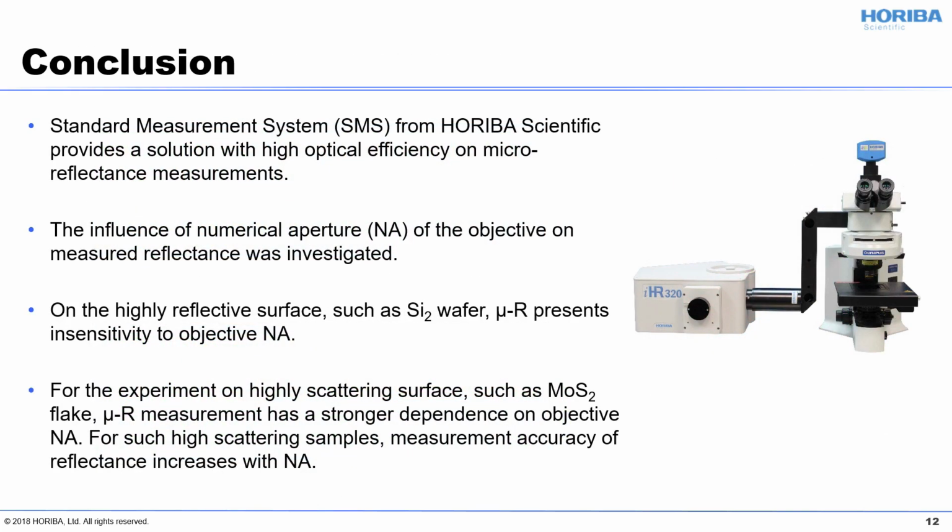So in conclusion, our SMS system shows very good performance on the reflectance measurement. And this is our classic system based on the standard microscope, which accommodates almost all major spectroscopy, such as Raman, PL, and lifetime reflectance, for example. We investigated the influence of the numerical aperture of the objective on different samples.